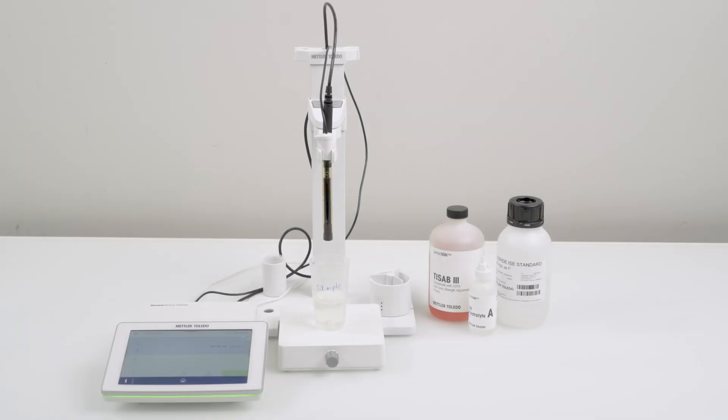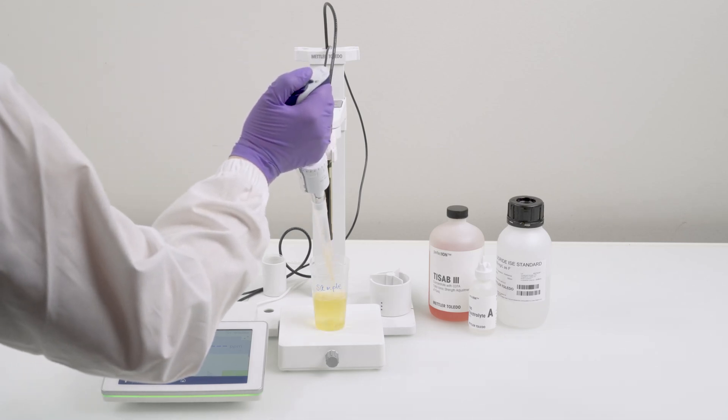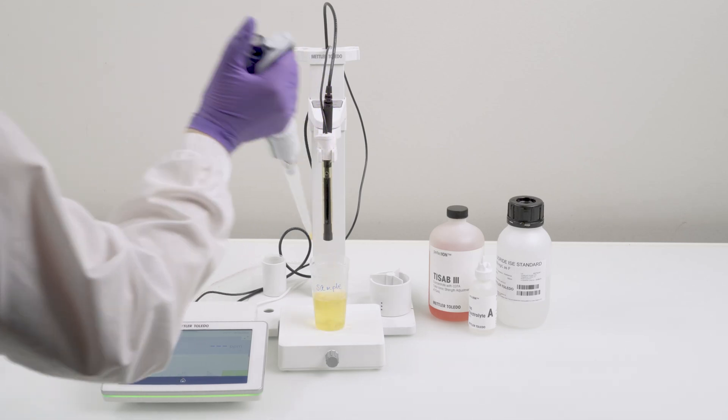Firstly, make sure that your electrode has been conditioned and calibrated before use. Now add the appropriate ionic strength adjuster solution to the sample to achieve constant ionic strength.